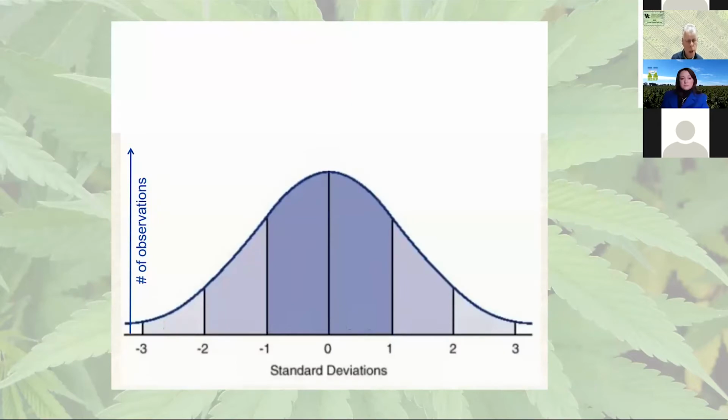This is a diagram of a bell curve, and it is very instrumental in analyzing data from a PT program. The height of the curve is the number of observations from a set of data. The very center of the curve is the average for a set of data.